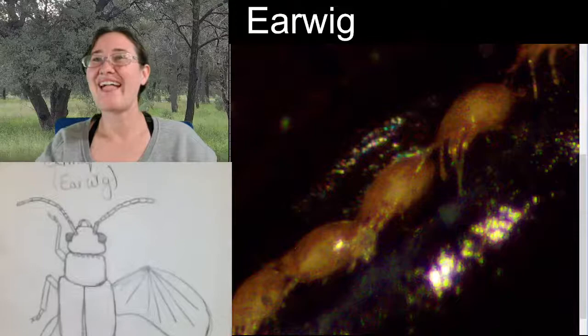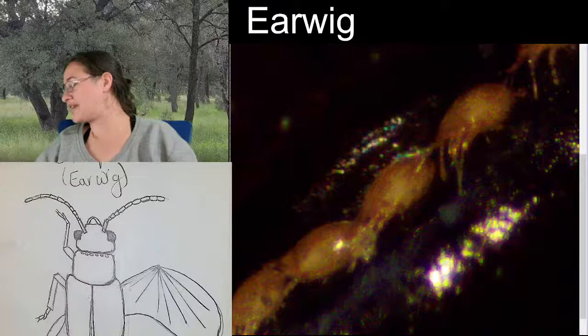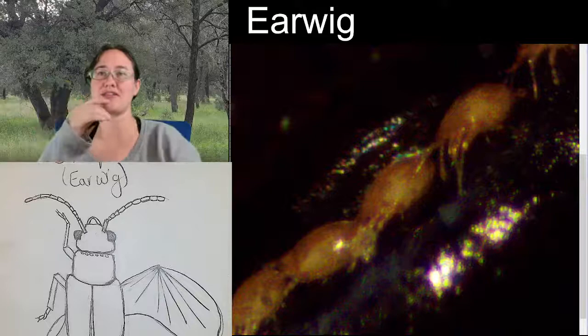I'm pretty happy with our earwig sketch today, and I'm glad that I was able to find those notes on the second tarsal segment and the way that it expands underneath the third one.